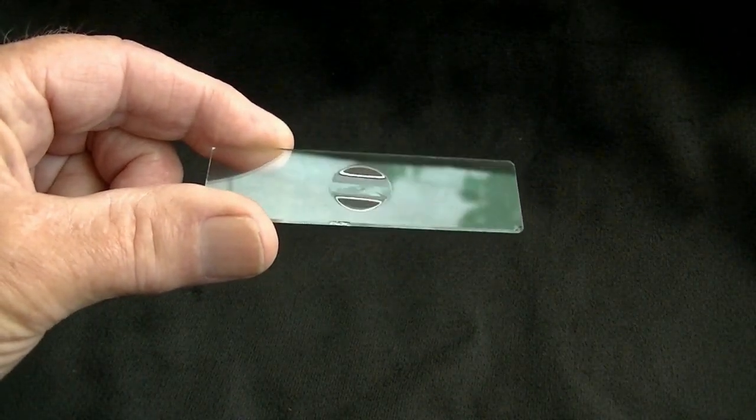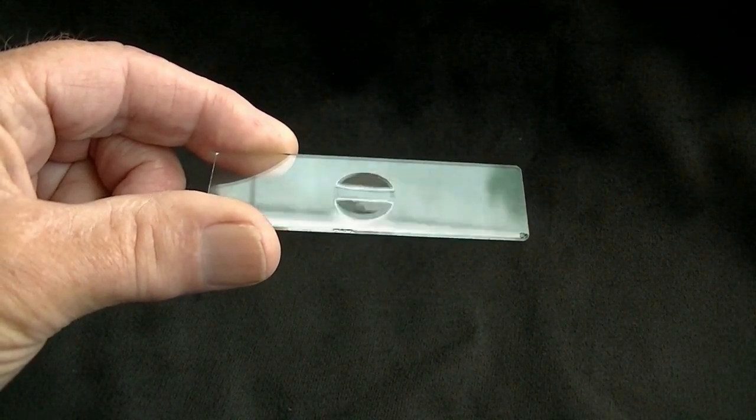To monitor live plankton, a depression slide is often used. This contains a small cavity.